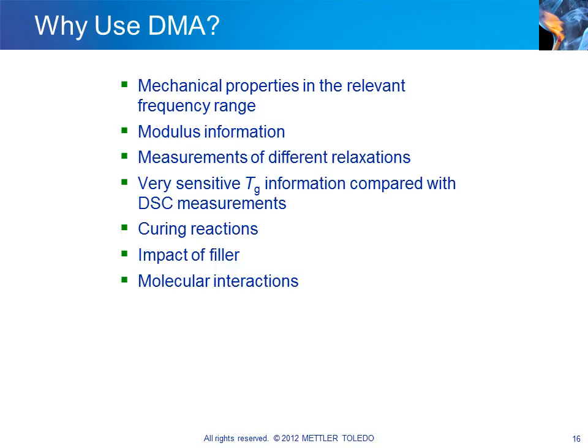Curing processes and the effect of fillers such as nanofillers and polymers can also be studied. Products with different nanofiller contents exhibit different properties due to interaction between the matrix and the filler. The information gained can be used to optimize the formulation used for manufacturing the products.